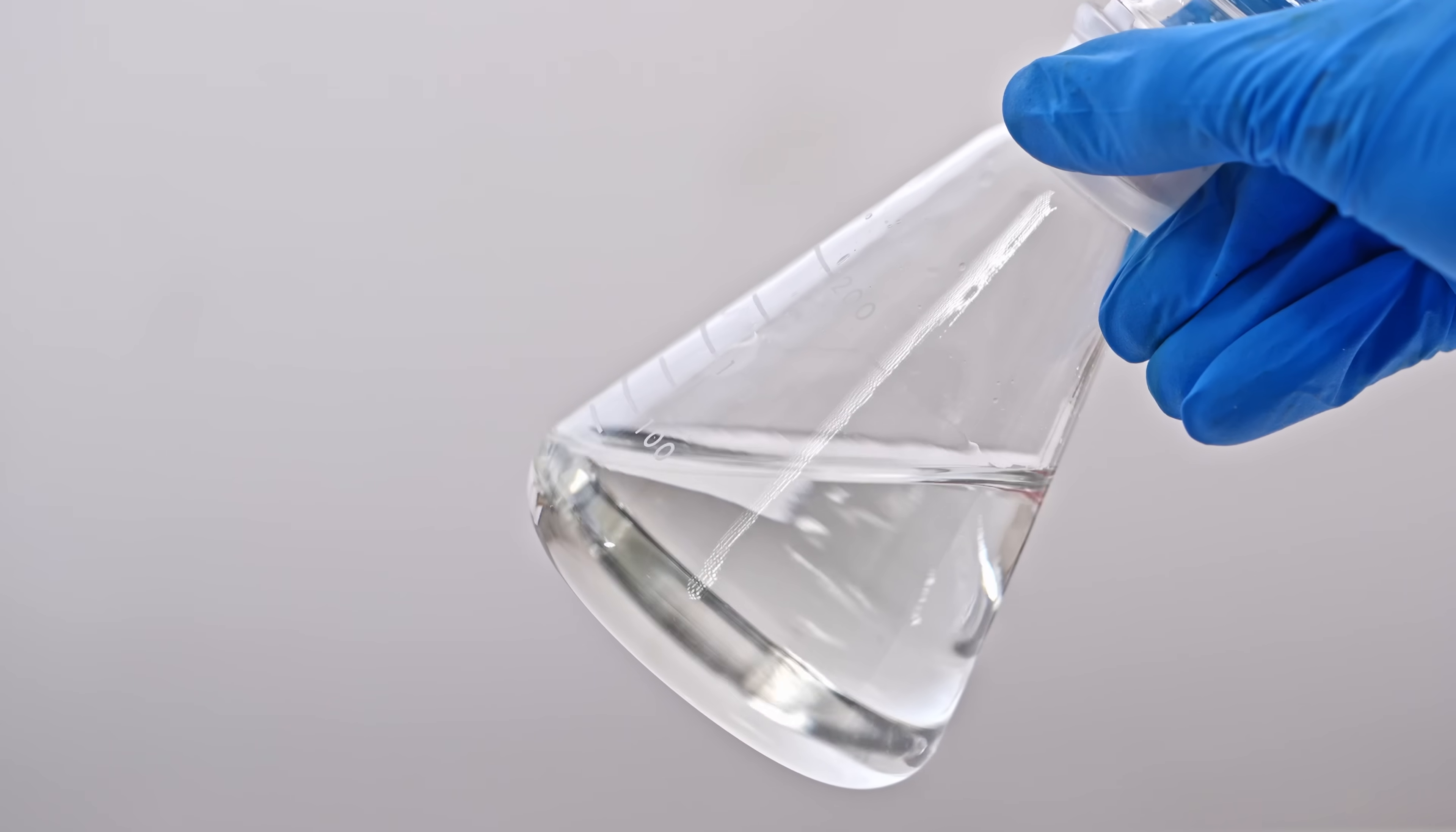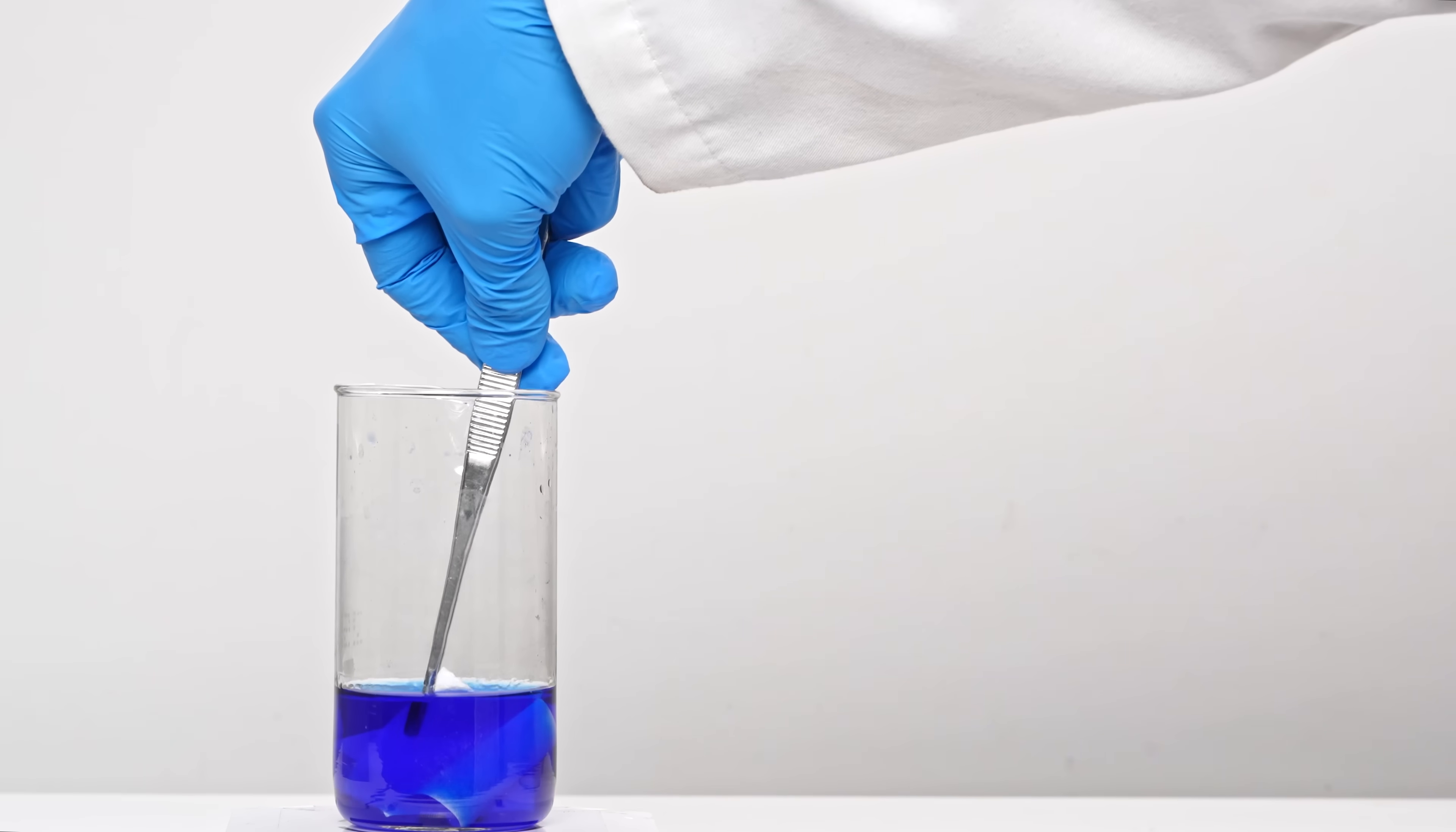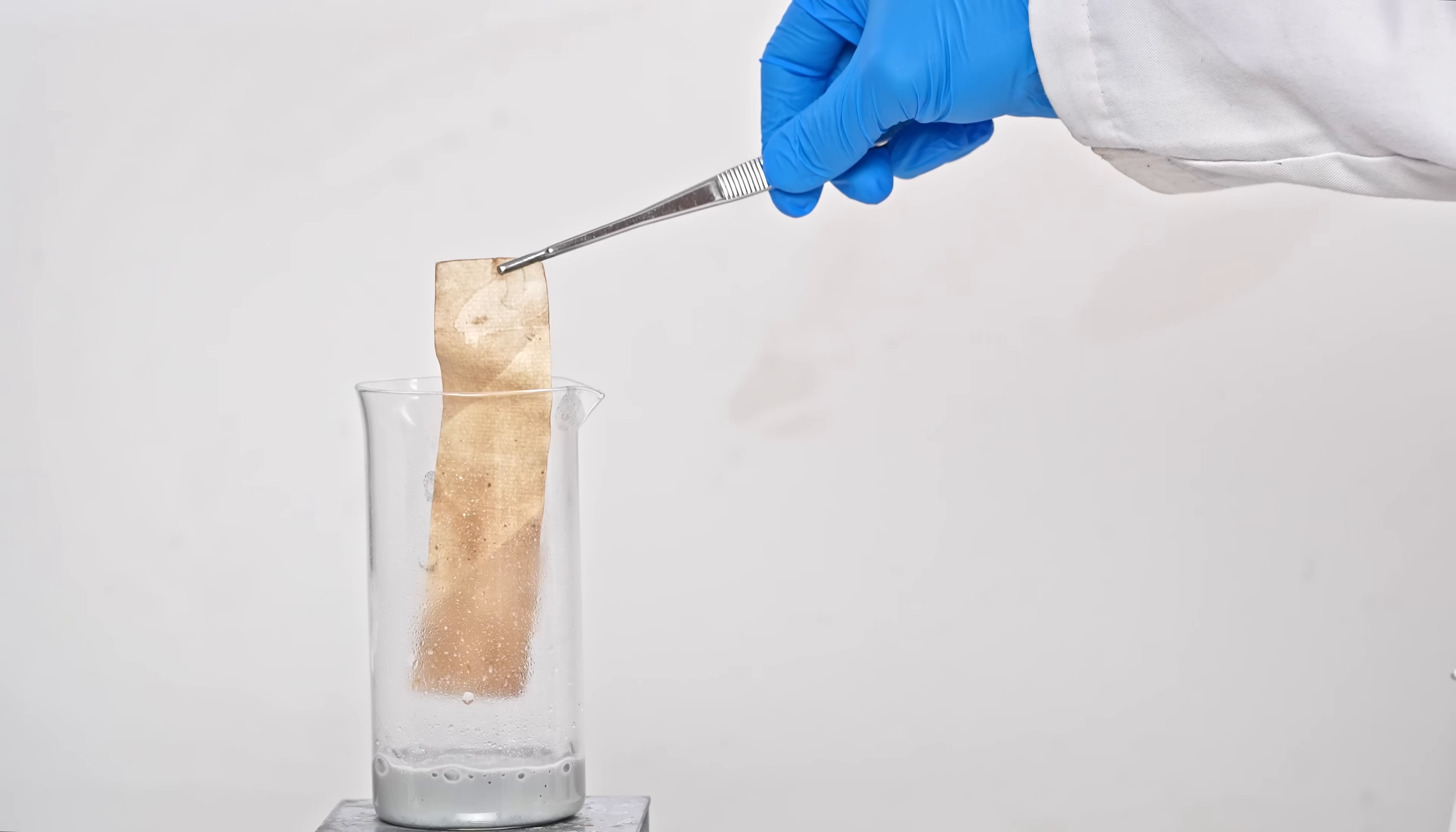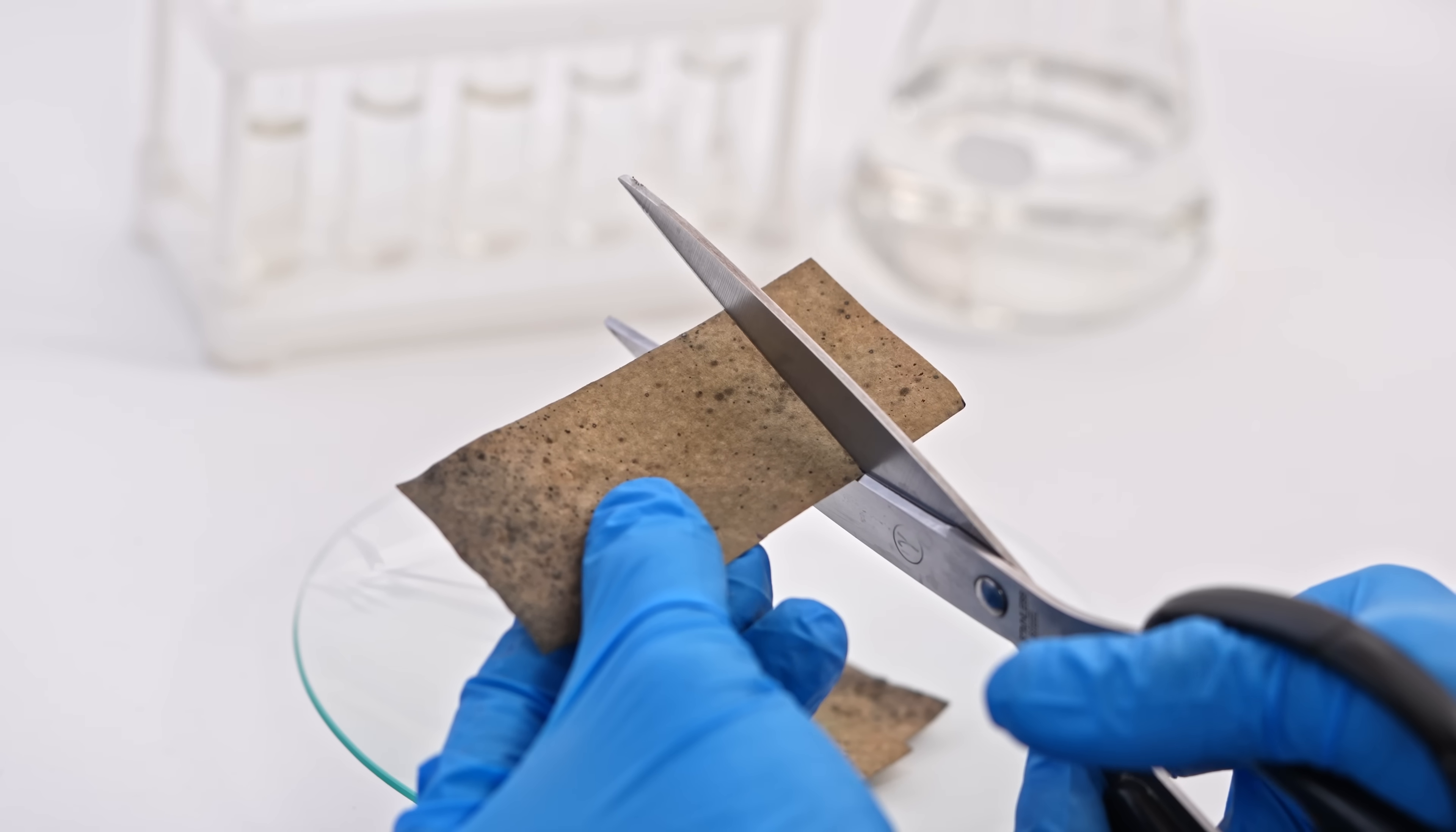To prove the solution contains cyanide, I'll prepare cyanide indicator paper. First, I mix copper sulfate with ammonia solution to create an ammonia solution of copper sulfate. Then I soak paper in this solution and expose it to hydrogen sulfide gas until it turns brown. After this we dry it and cut it into pieces. This will be cyanide indicator paper.